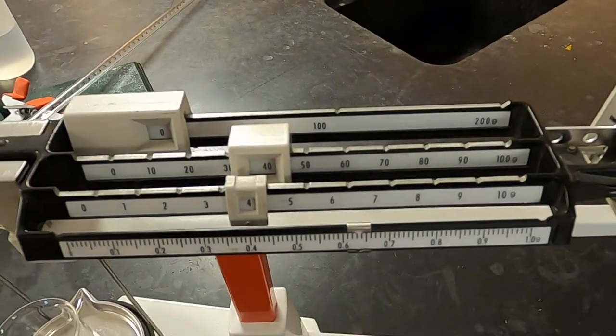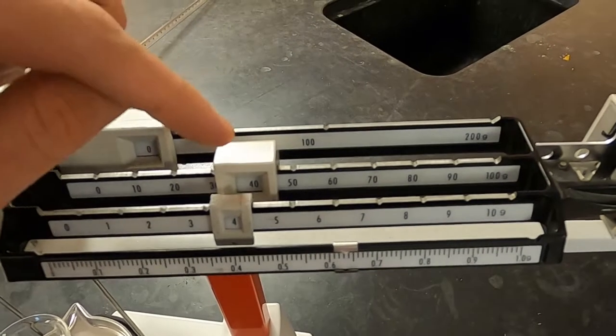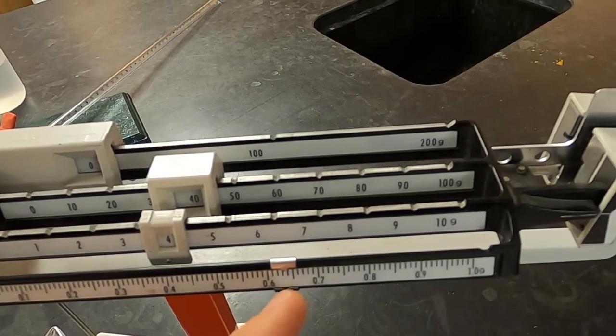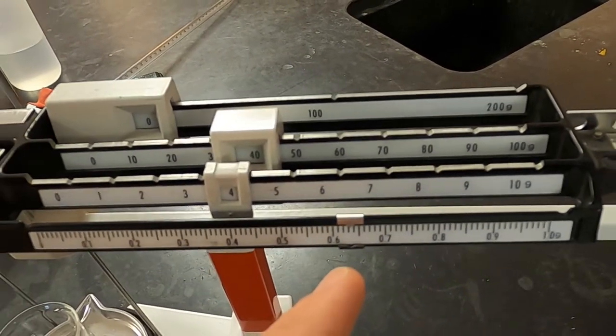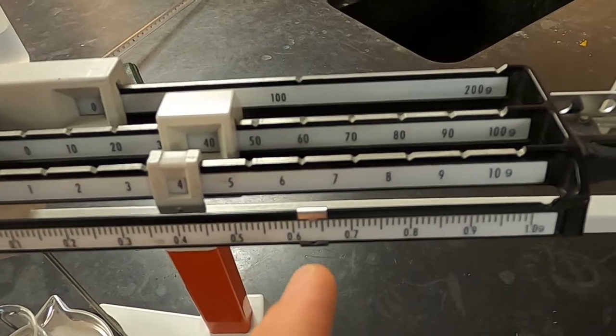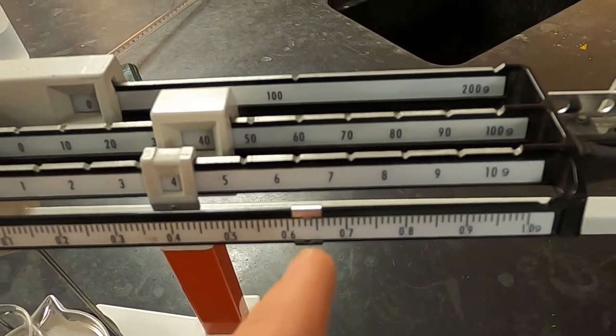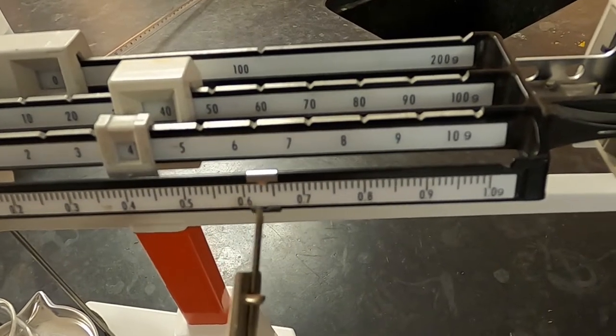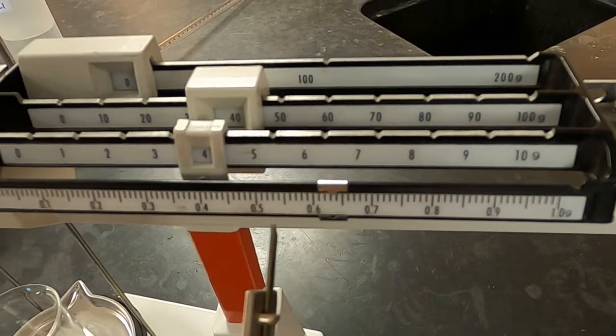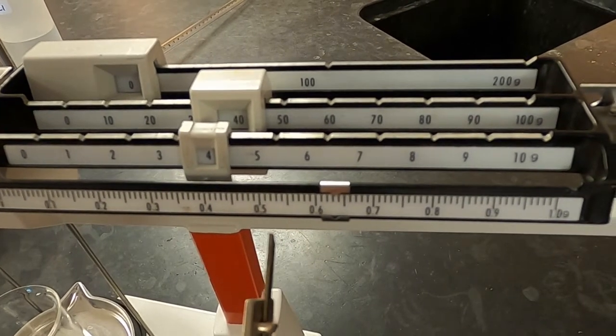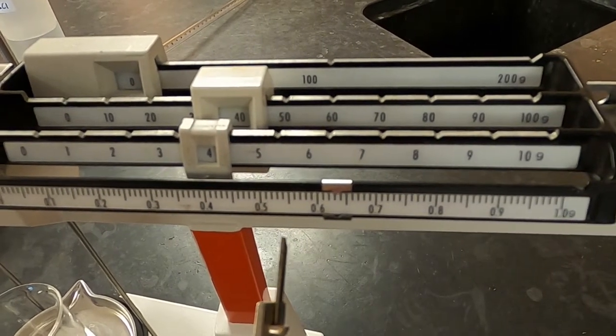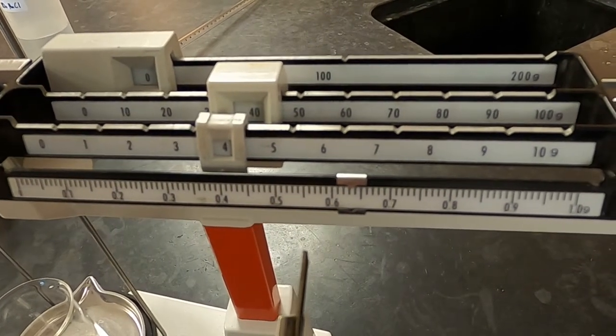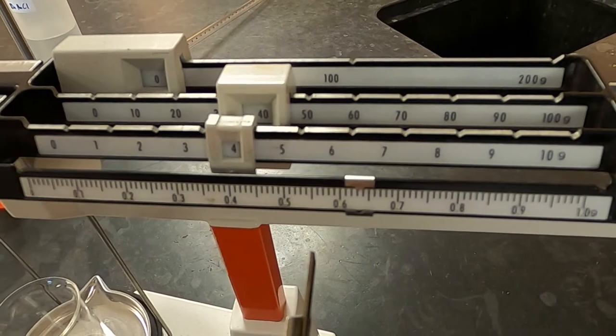Now to read this correctly, the mass of the beaker is 44.6 and then each of these marks is worth 1 hundredth of a gram. So 0.61, 0.62, 0.63. And then we estimate where between the 0.63 and the 0.64 it is. So I'm going to estimate that it's going to be one-tenth of the way along and so the final mass that I would report for this is 44.631 grams.